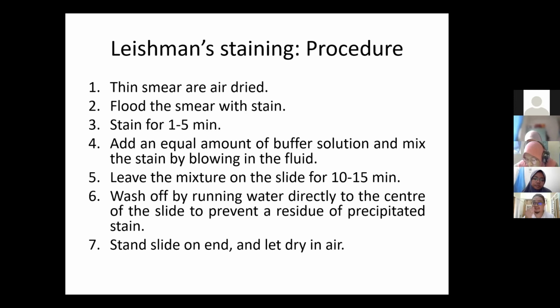One of the ways, especially if you have a lot of slides, is to take a rack, arrange your slides onto the rack, put it in a container, and then turn on the tap water. Let the tap water drop into the container, but not directly onto the slide. It will fill up the container and overflow. This is a very nice way to wash gently, letting it overflow. It is not directed at the thing we want to clean; it overflows and takes off all the material that we don't want.